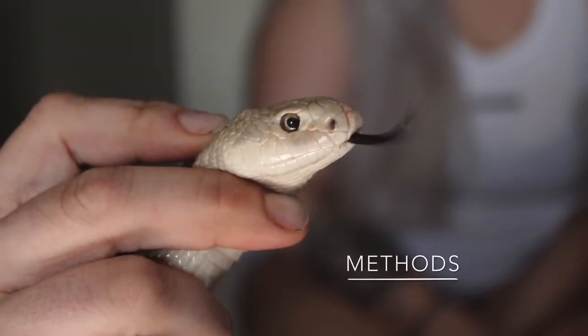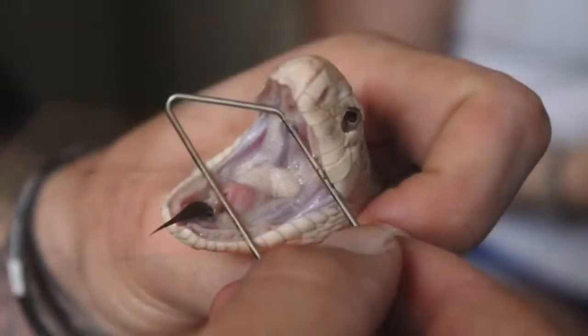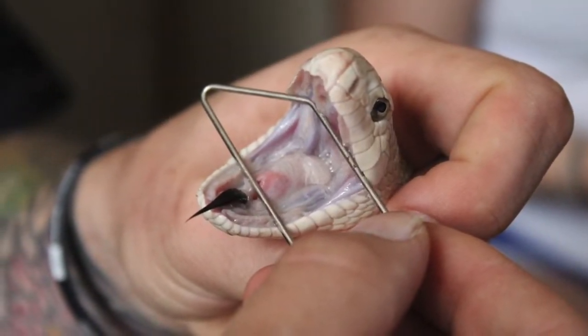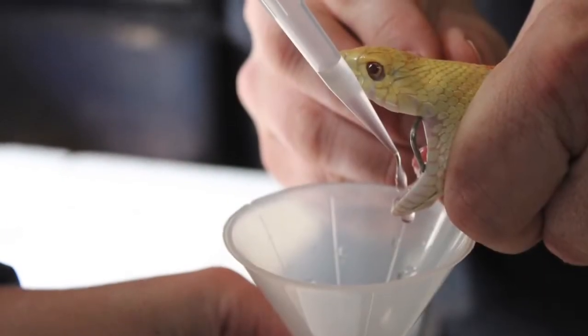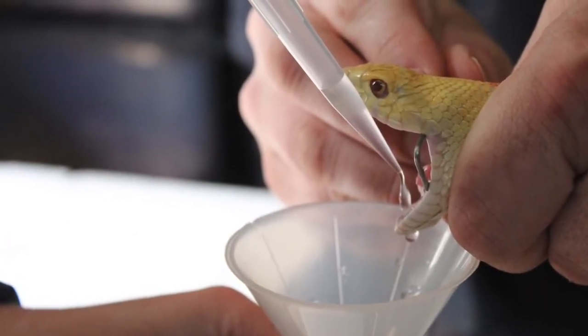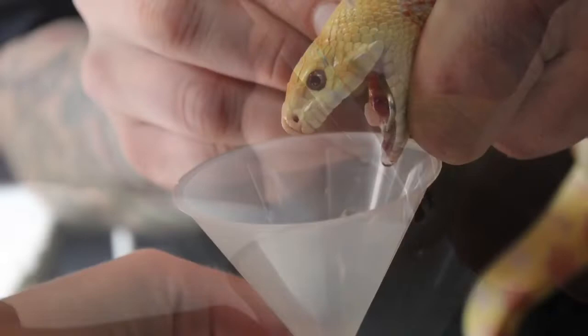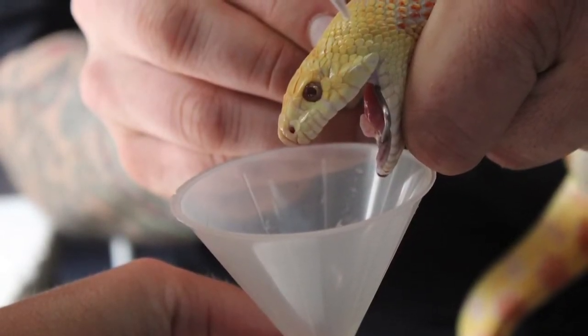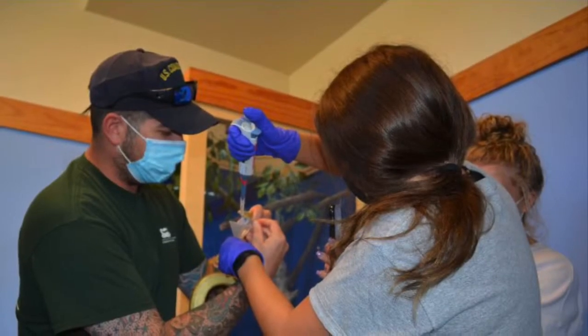To begin our project, we first needed to collect saliva samples from a number of different non-venomous snakes. To collect each saliva sample, we opened the mouth of the snake with a specular mouth prop as pictured here, then sprayed one milliliter of deionized water into the mouth of the snake and then collected the liquid as it dripped out of the mouth.